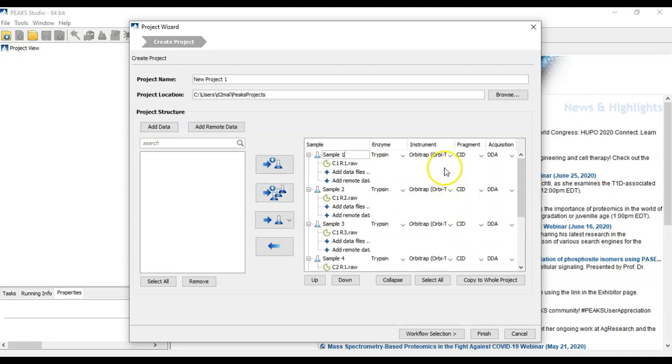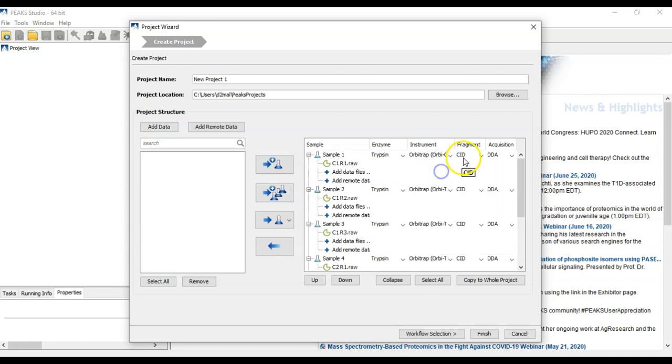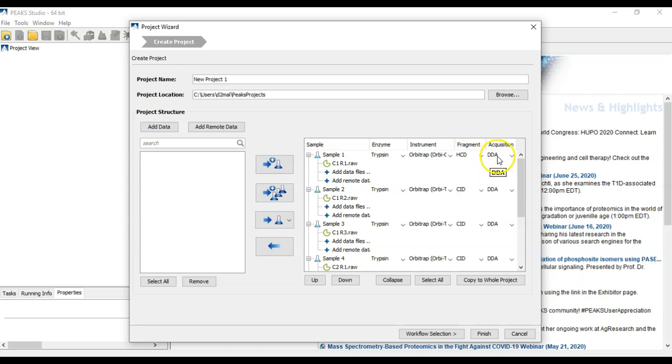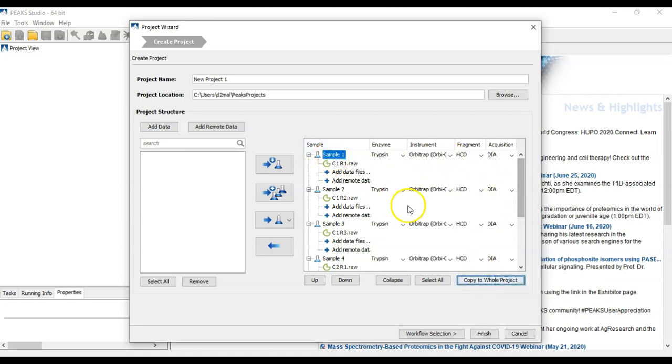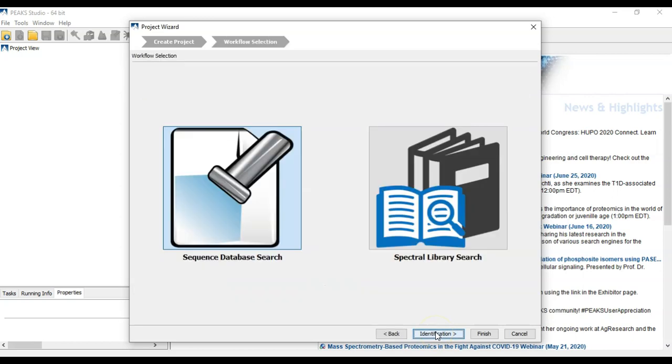In this case, we're dealing with some Orbi HCD DIA data with a Trypsin Digest. Click this button, and then Copy Whole Project to copy those parameters to the whole dataset. And click Workflow Selection.